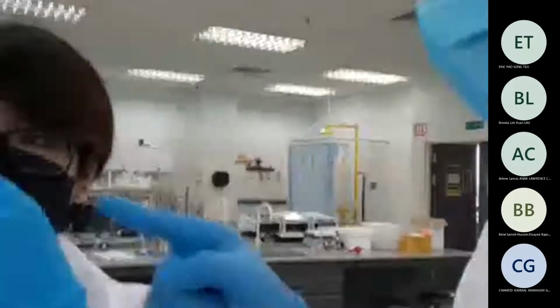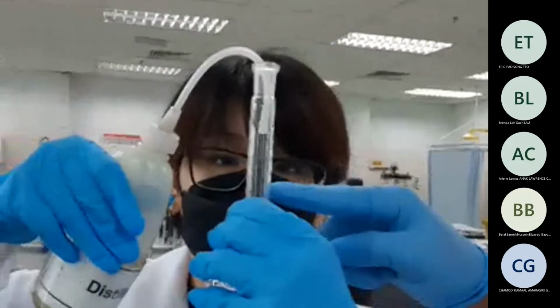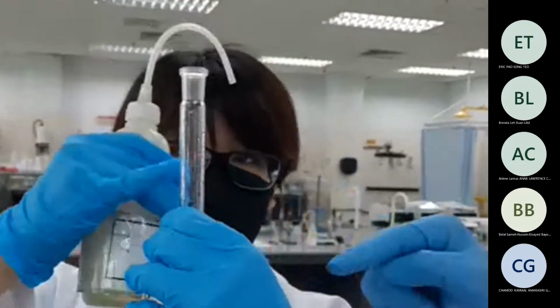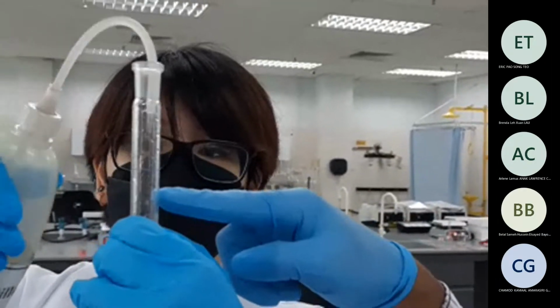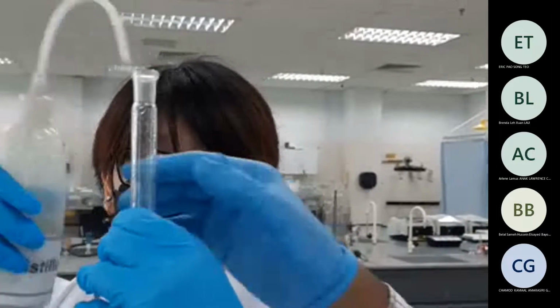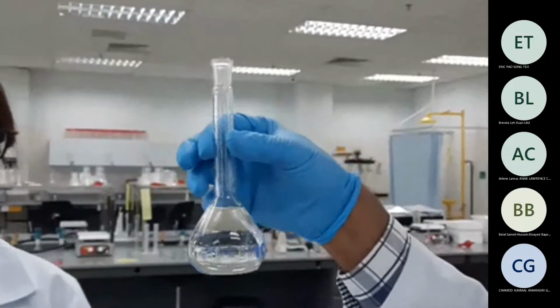Okay, Vanessa is doing now. So keep pouring the water until it reaches to this part probably, so it doesn't reach here. No, don't put until here, put here until here, and then, oh, hold on. So here, it reaches almost to the collar, right?